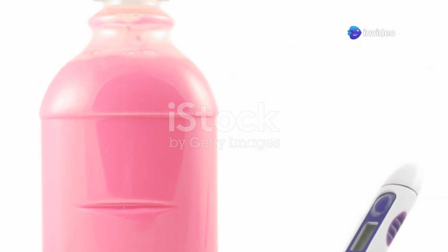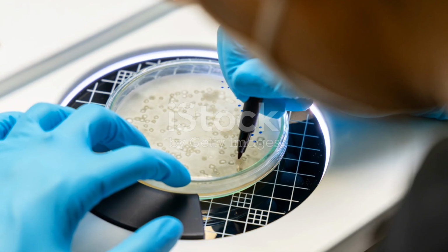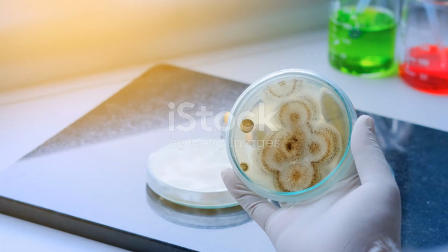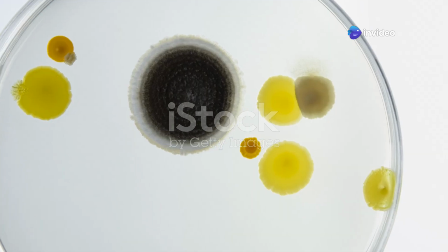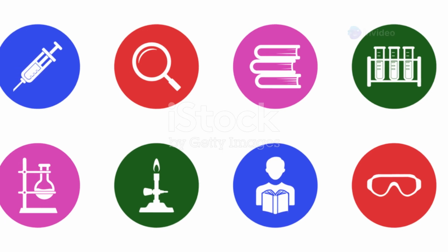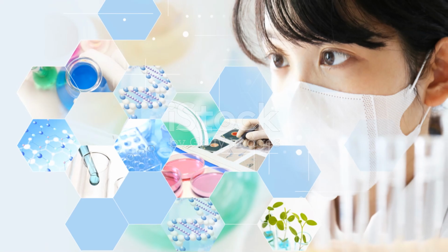Now, you might be wondering, why is it so important to differentiate between gram-positive and gram-negative bacteria? Well, my friends, this simple stain provides crucial information that helps doctors choose the right treatment for bacterial infections. Knowing the gram stain characteristic of a bacterium can help guide antibiotic therapy, as different antibiotics are effective against gram-positive and gram-negative bacteria. So, let's put on our lab coats and delve into the colorful world of gram staining.